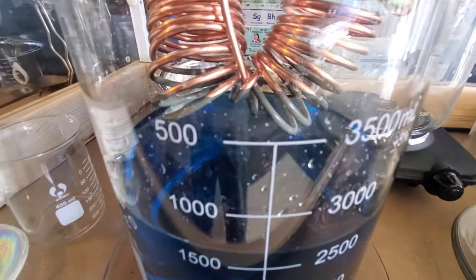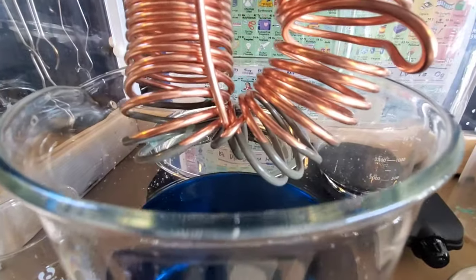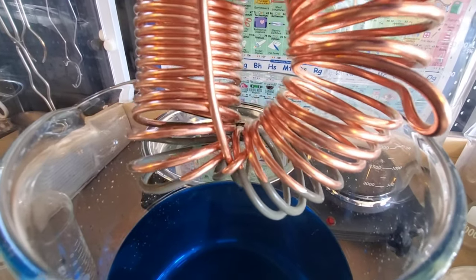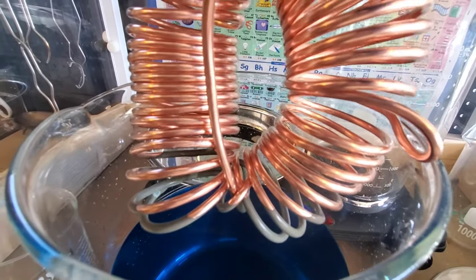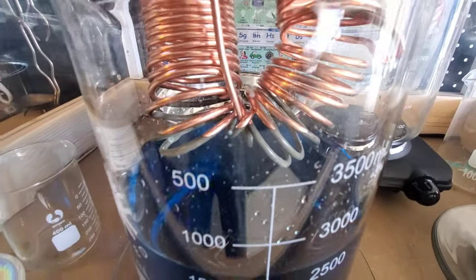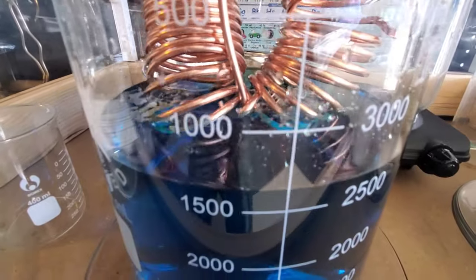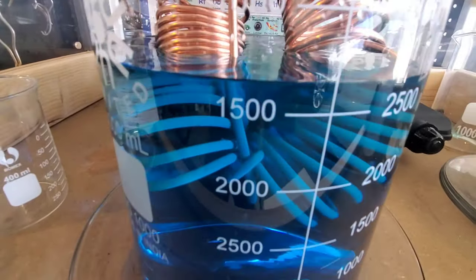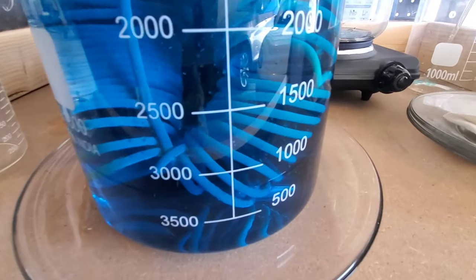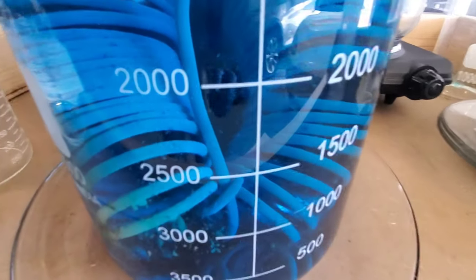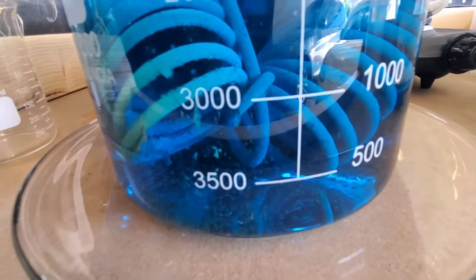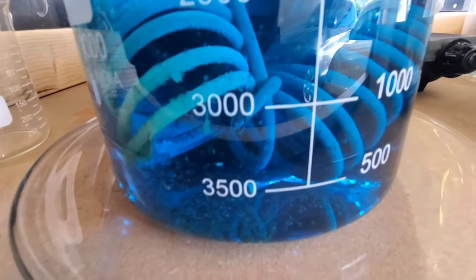Now you can already see instantly that reaction taking place. That gray color on there is actually the silver already forming into a silver cement. There's that silver already falling down towards the bottom of the beaker here.